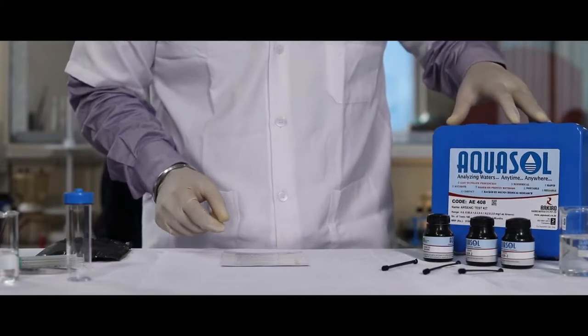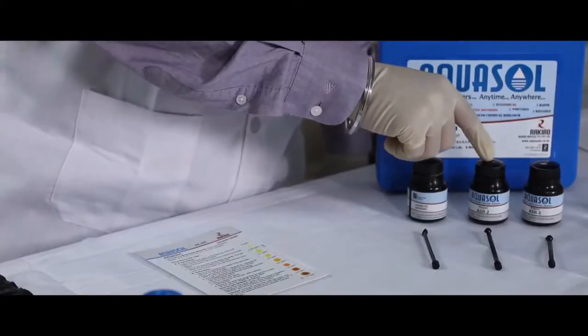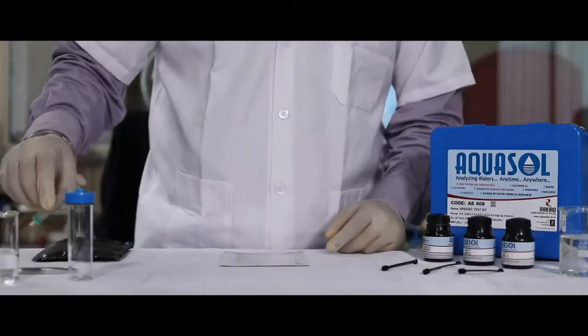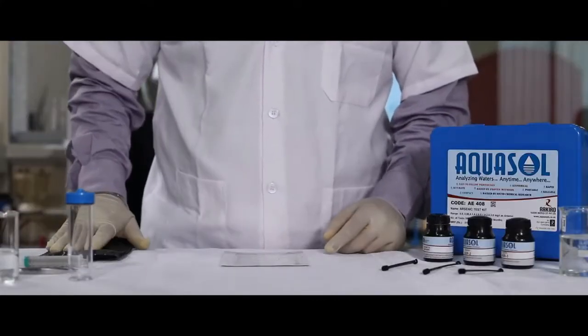This is an arsenic test kit consisting of ASR 1, 2, 3 along with a test bottle, syringe, test paper, and procedure card.